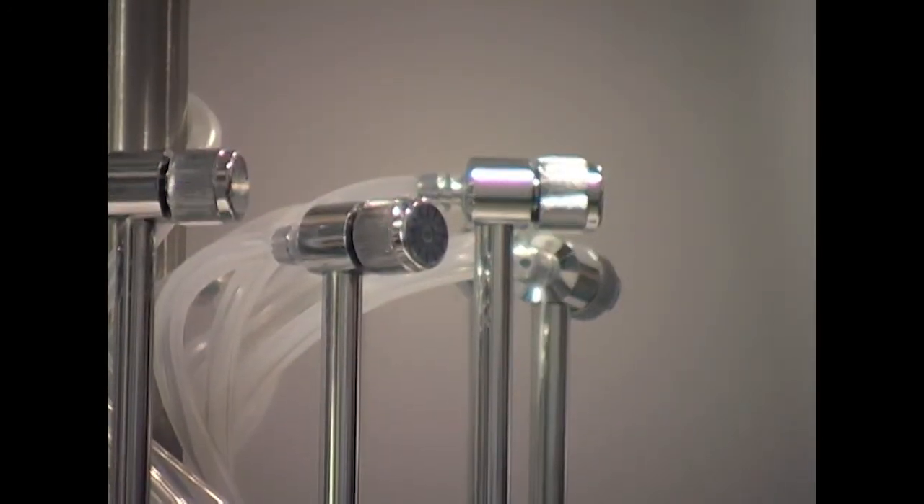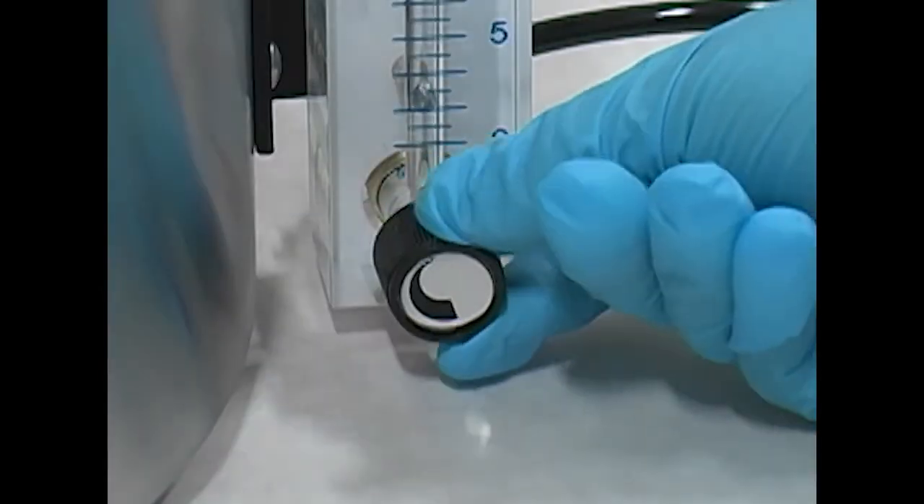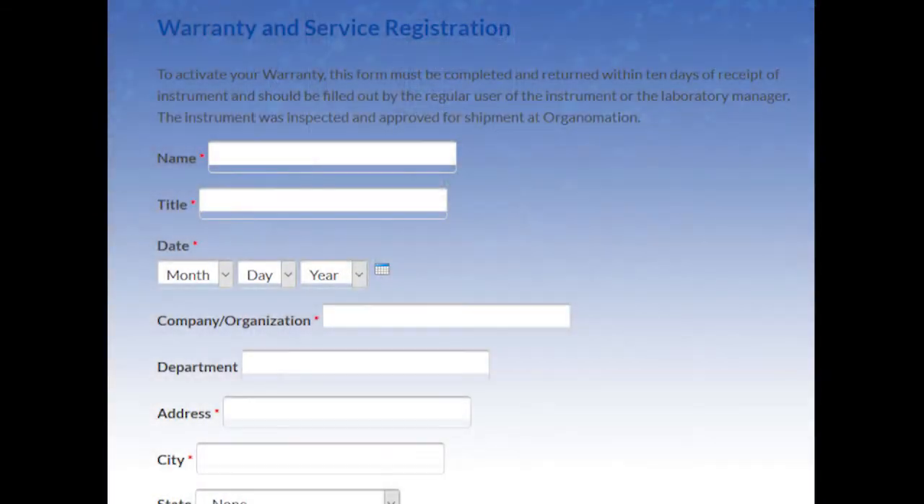Raise all valve tubes to their highest position. Turn all needle valves on the valve tube assembly off by rotating clockwise. Close the valve on the flow meter by rotating clockwise. Once assembled, don't forget to fill out the warranty and service registration form and return it within 10 days of receipt of the instrument. Once we have the completed form, your warranty will be activated.